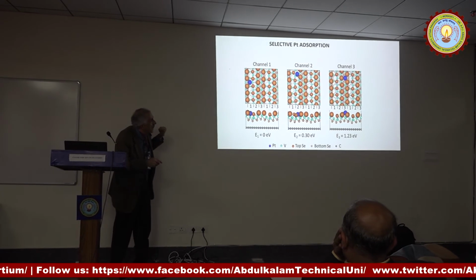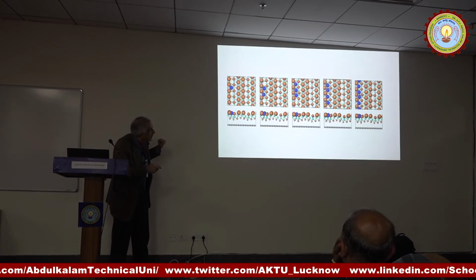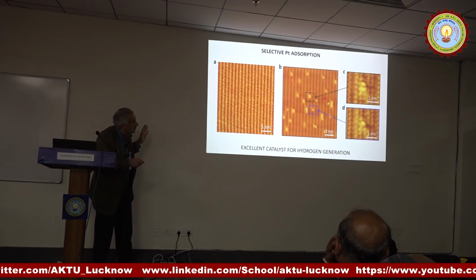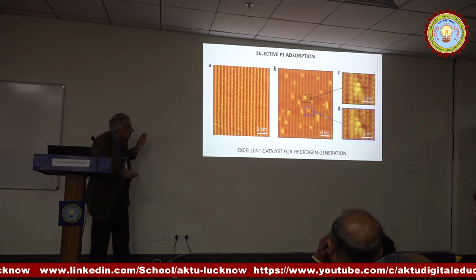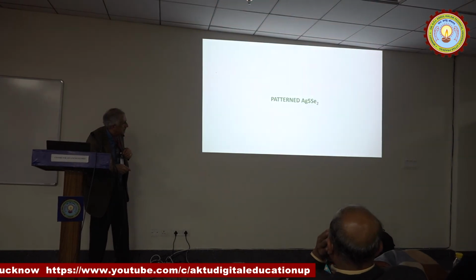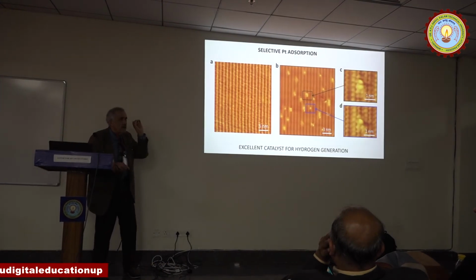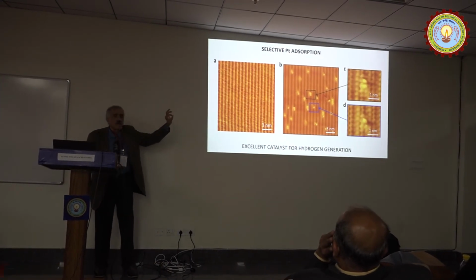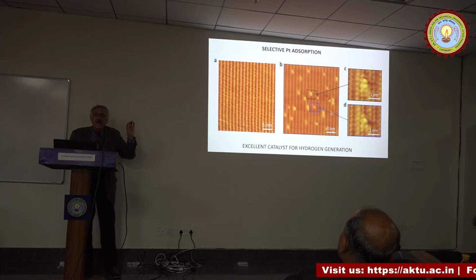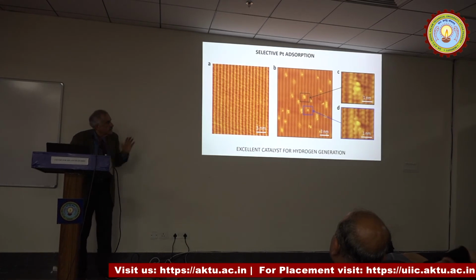And indeed they go in an isolated fashion, always in these channels. Here is a case, and then they go like that, or like this, or like that. And experimentally, they do exactly what we said they do. They go in those stripes and sit in there. Here's the details. And here, the thing we did, what happened to my slide? I don't have it. I lost it. It's a slide that shows you the calculations that monatomic platinum on this material, we calculated its catalytic activity, and we found out it's extremely close to that of a platinum surface. All right? So I will leave that at that.